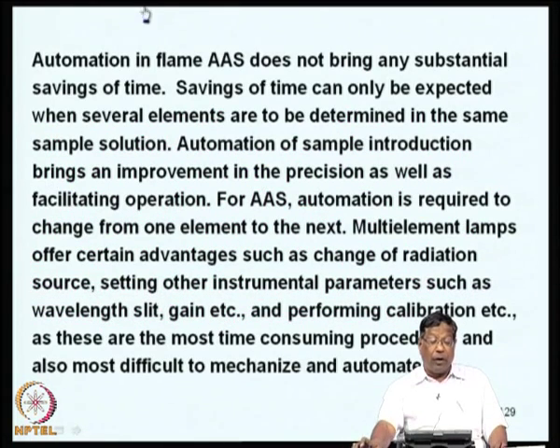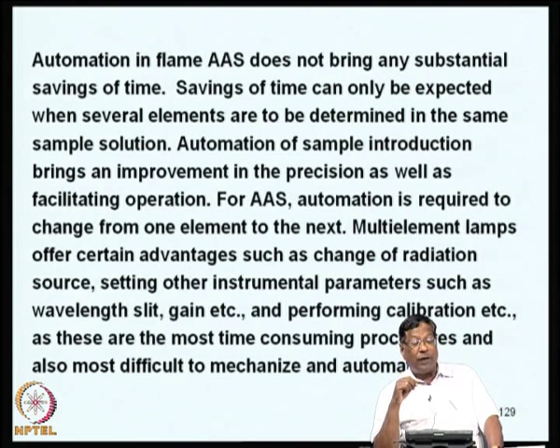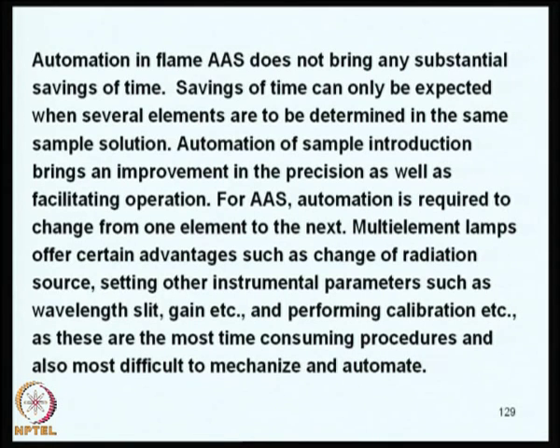So, automation in flame basically does not bring any substantial saving of time. Savings of time can only be expected when several elements are to be determined in the same sample solution.